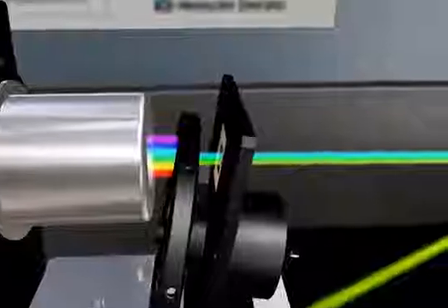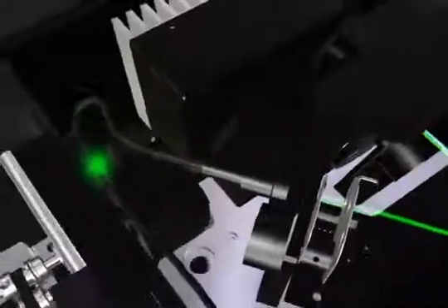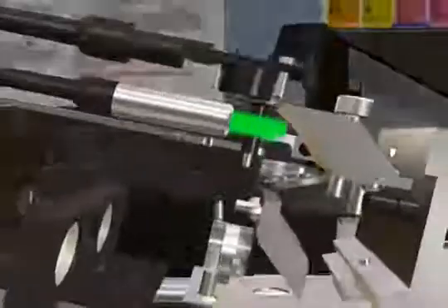The heart of the SpectraMax is its unique dual monochromator wavelength selection system. Filters are best at restricting non-target wavelengths. Monochromators are best at selecting a specific wavelength.